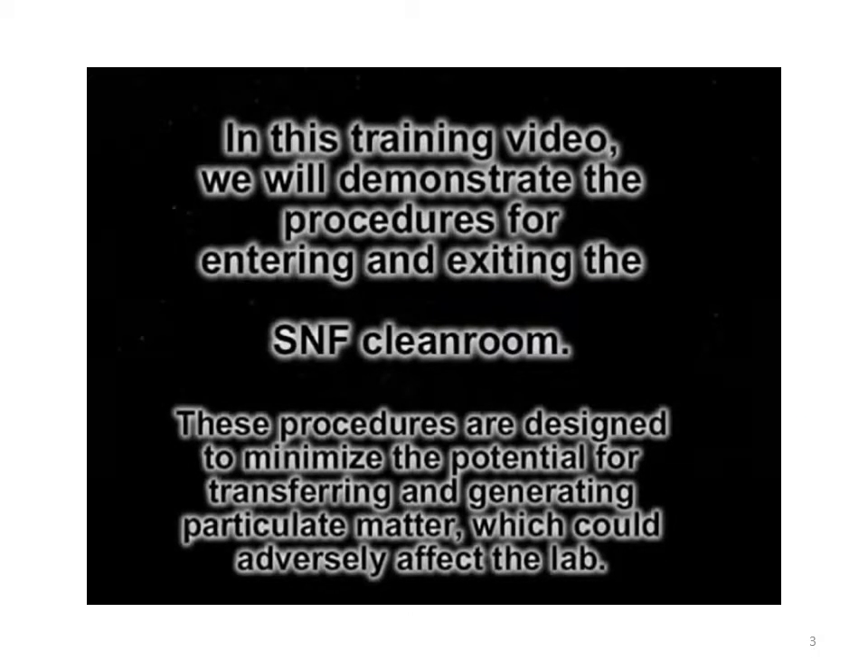In this training video, we will demonstrate the procedures for entering and exiting the clean room. These procedures are designed to minimize the potential for transferring and generating particulate matter which can adversely affect the lab.